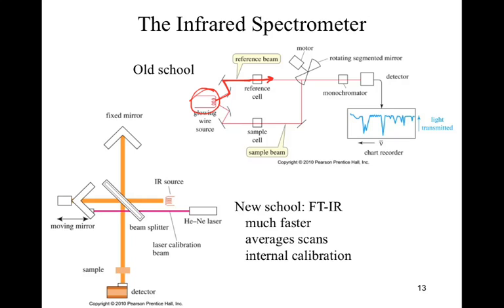Remember, there's a whole bunch of air in here as well as over here. If there's something in there that's absorbing IR energy or IR light that's not within our sample, we need to be able to cancel that out. So that's what the reference cell is there for. Determine what that reference signal is. I can then subtract that from my sample signal so that I get only what was in my sample. Okay, so a lot of spectroscopy will do this. We'll always have some kind of zero to compare things to or to remove stray data.